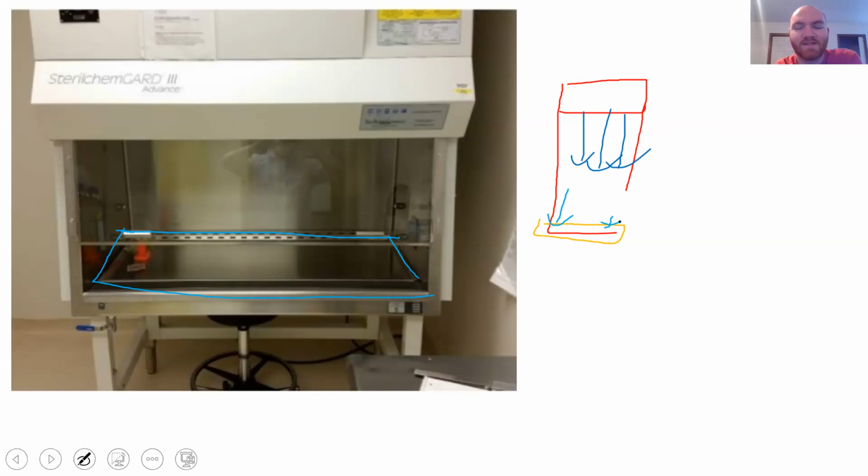And that's not just a one-step filtering process. There's more to it. And then from the outside air, there's going to be slight air currents that will keep air from exchanging. And then the suction will suck air from the outside straight in instead of letting it enter the actual hood.